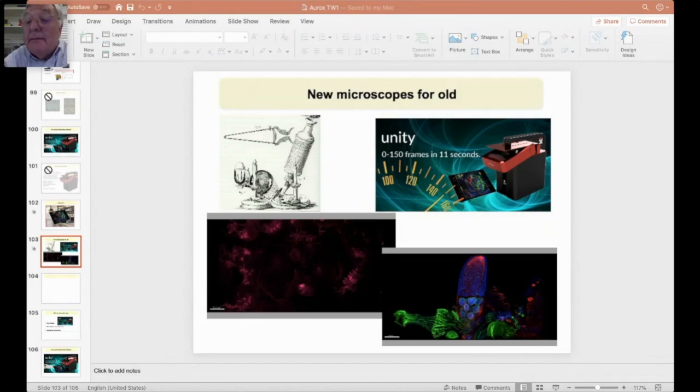I have a question. I remember when I first came to this field, OBIC was still going strong and was regarded as a sort of future of scanning optical microscopy. What became of OBIC? I don't know. I think it was a very good technique. For people who don't know, it's the optical version of the electron microscope EBIC technique, where you scan an optical beam across a semiconductor, generates electron-hole pairs which can probe various properties of the device. And in a way, it's superior to the electron beam because there's no electron beam damage.